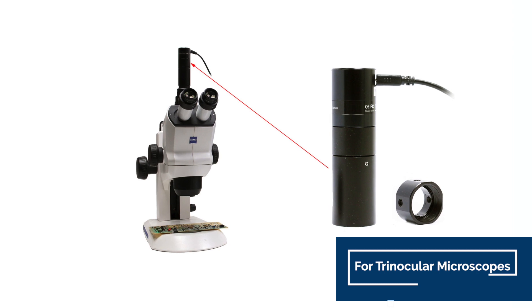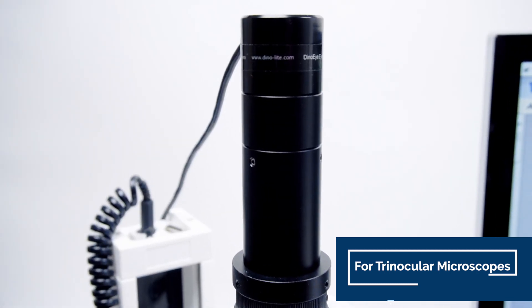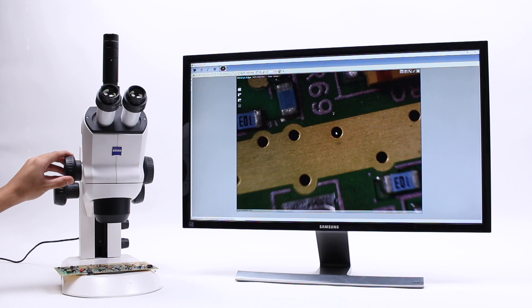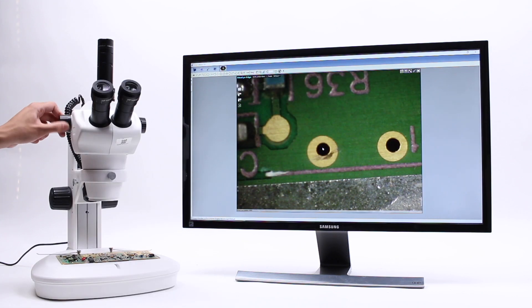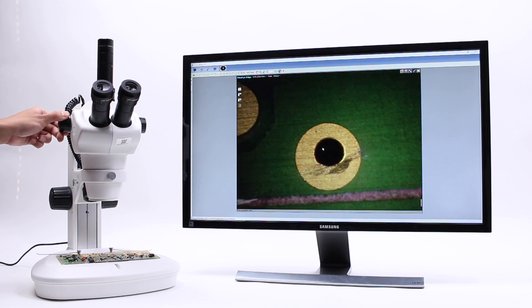The AM7025X includes our powerful DynoCapture software for taking photos, videos, performing measurements, and much more. Using the included DynoCapture software, you can digitally zoom your field of view up to two times.